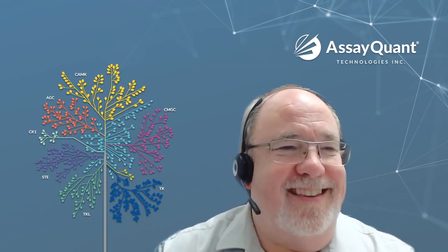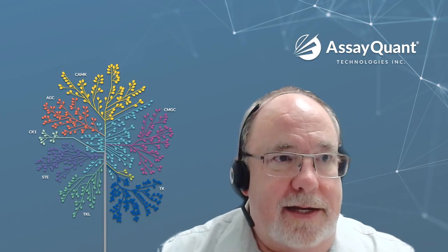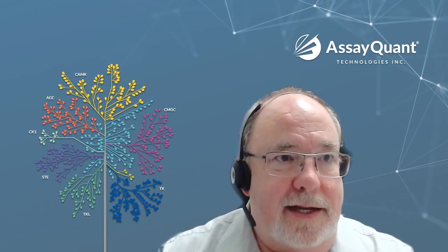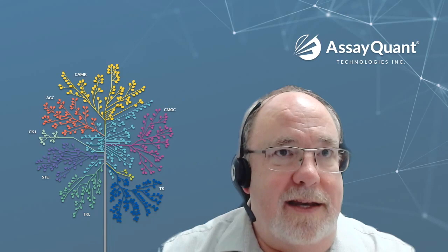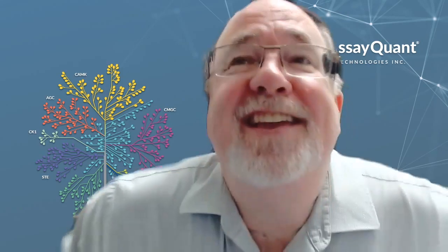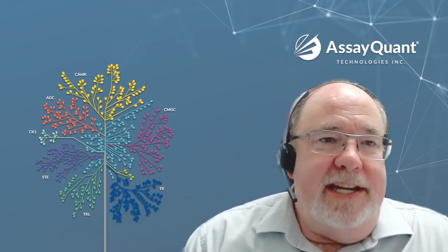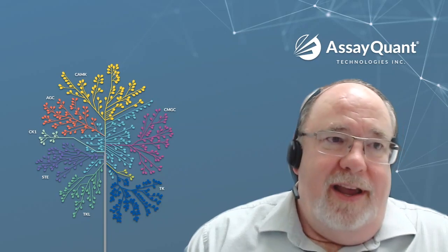Yeah, I think so. And while we have you, for all the nonlinear kinetic curves, how do you fit the rate, non-first order, to calculate the IC50? Oh, we actually have a really sweet automated linear range finding algorithm that we use.